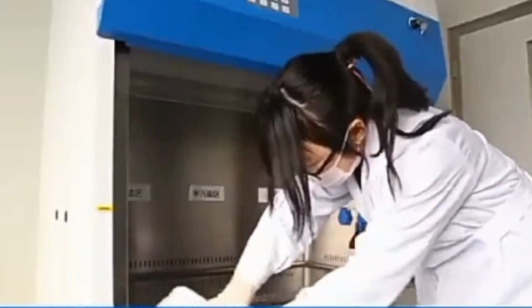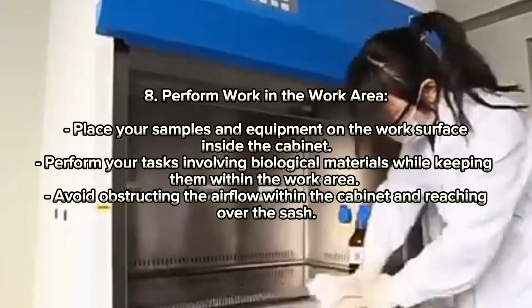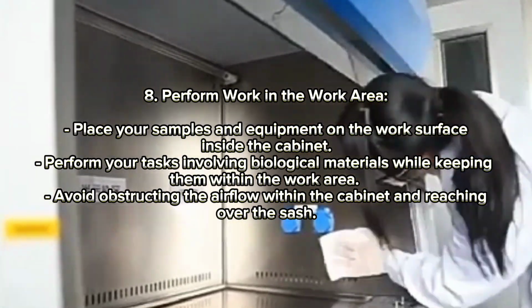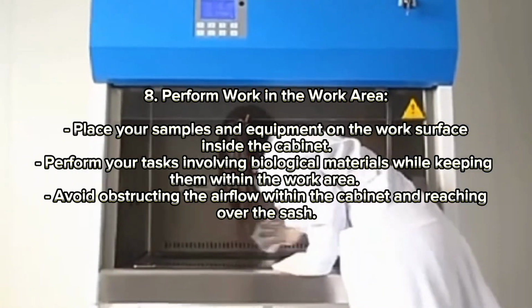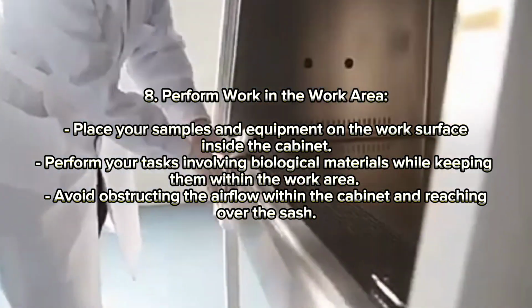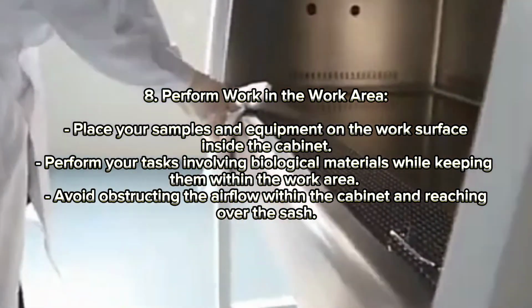Next, perform work in the work area. Place your sample and equipment on the work surface inside the cabinet. Perform your tasks involving biological materials while keeping them within the work area. Avoid obstructing the airflow within the cabinet and reaching over the sash.